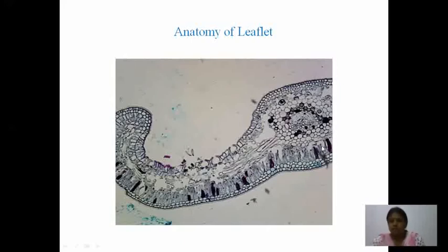In the vascular bundle of the midrib and some leaf traces, you see the two types of xylem. That condition is known as diploxylic. Here you see the centripetal and centrifugal type of xylem. In the centripetal type, it is triangular in shape and there is one protoxylem.